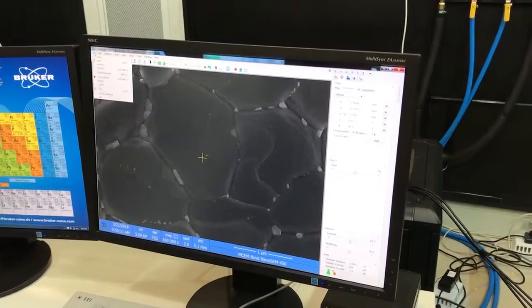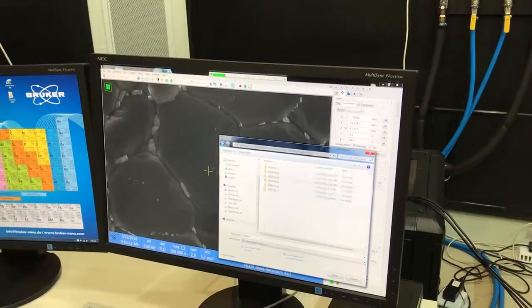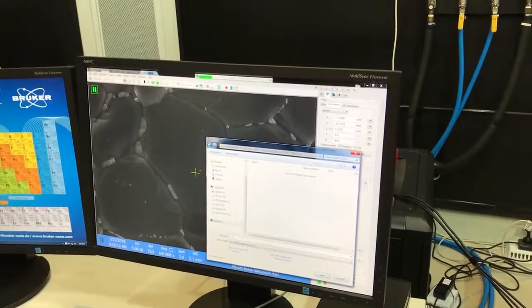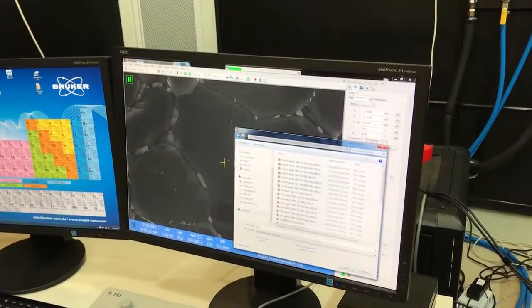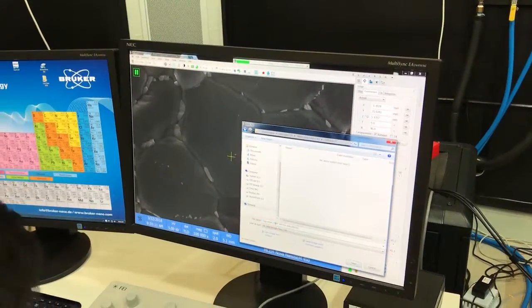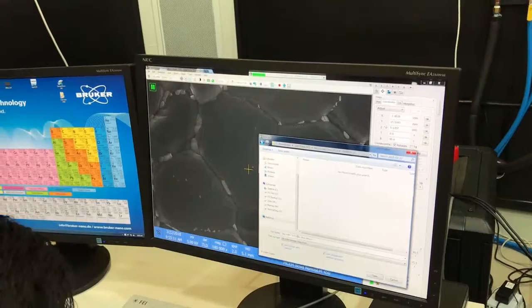That's why it was so noisy, because the dwell time of the beam at each point on the specimen, which produces each pixel, was very short. When he lengthened that dwell time to 20 microseconds per pixel, it gets far more counts, the noise is greatly suppressed, and you get much greater signal, and that's why he's got this beautiful image of the background, which I think he's saving at the moment.